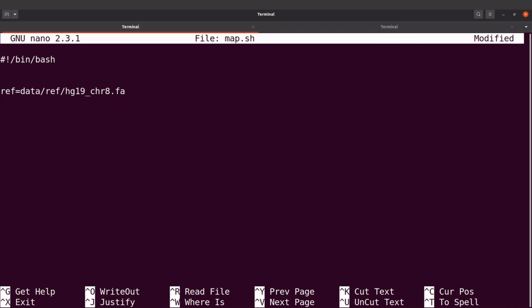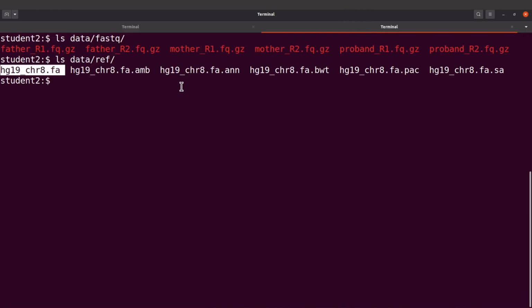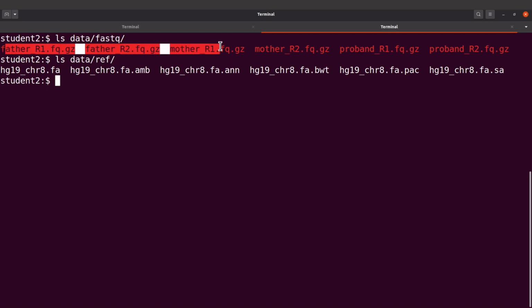And then when we come down here, we can also specify the directory where the FASTQ files are. We can do that here. But anyway, let's proceed. First of all, we need to get the FASTQ files. So this is where the other trick comes in. I'm going to give you a generic approach. So this is what we have. This is forward and reverse. What we are going to do is to get only the forward reads. That means we will get R1, R1, R1. That's what we are going to get.